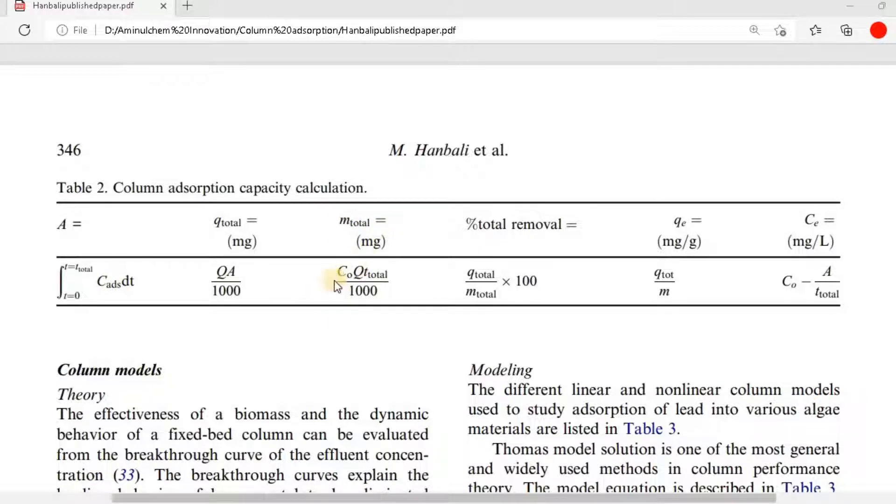And M total equal to C0 Qt total divided by 1000, and percent total removal equal to Qt divided by M total into 100.